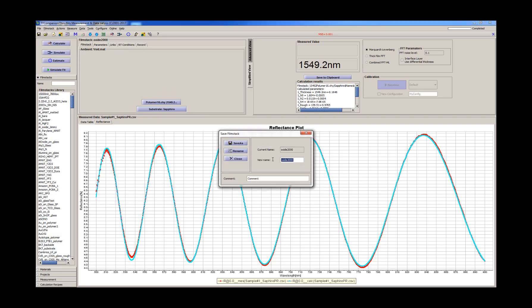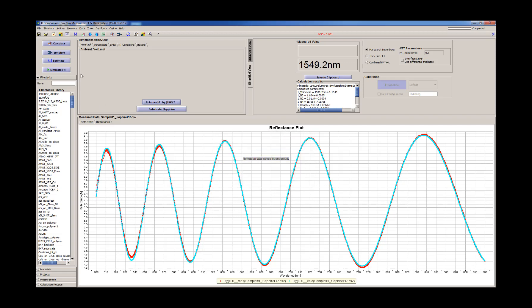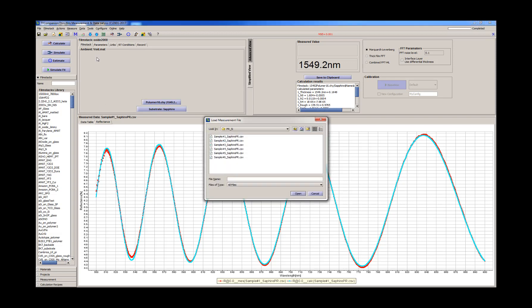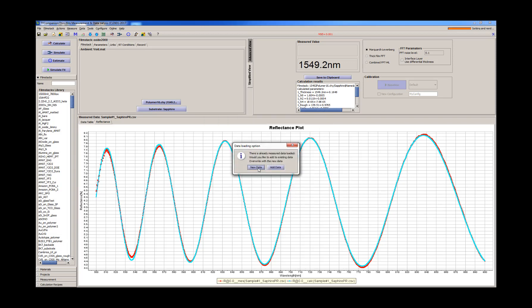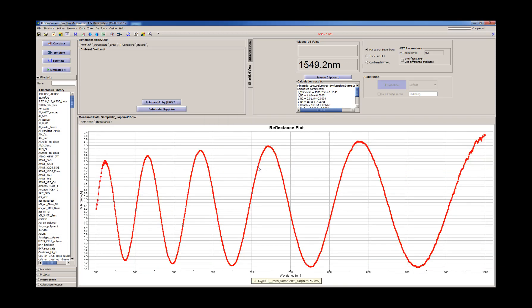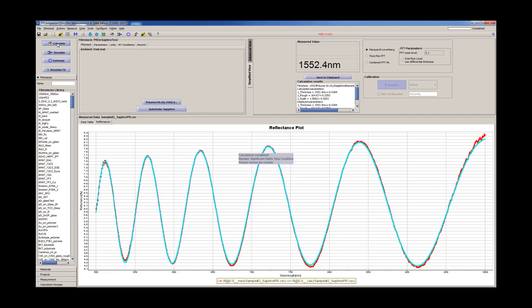We'll save here as sapphire test. And we can try some other data. So we have good results here as well.